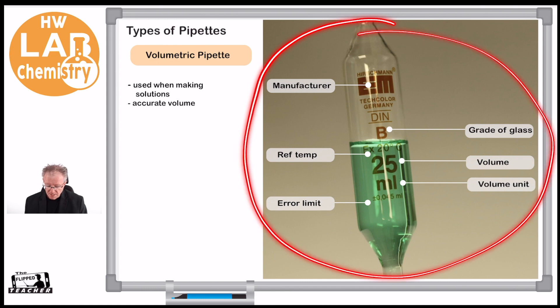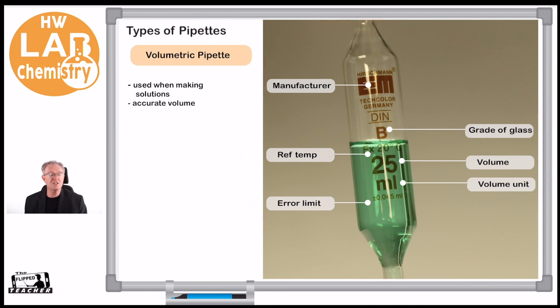As you can see from the close-up here, these are all the different things you see on the side of the pipette. This is known as a bulb volumetric pipette, and you can see we've got an error limit. So when we draw up some liquid, it's accurate to 0.045 of a milliliter—that's pretty incredible.